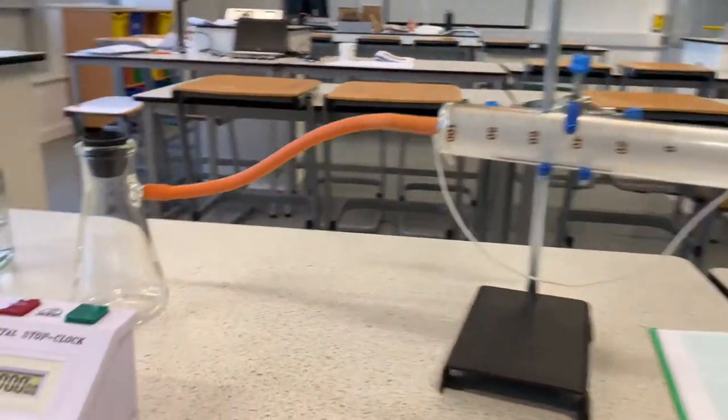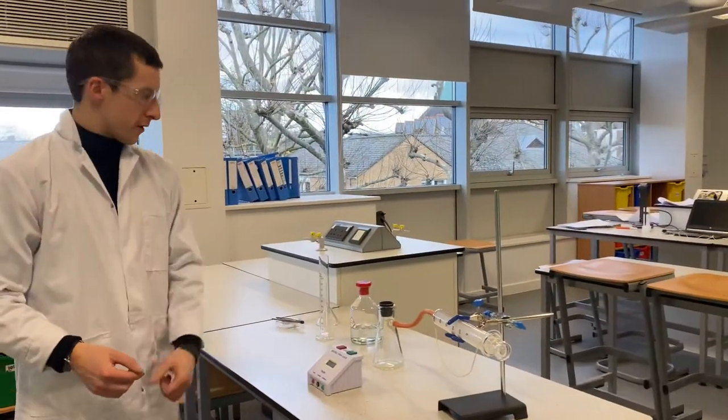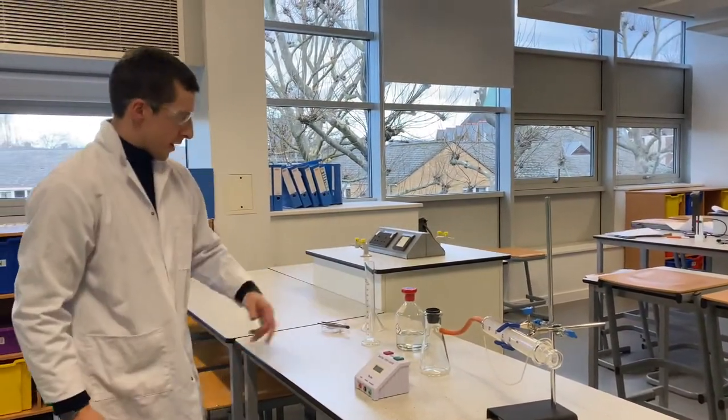Hello Doc, what do we have here? Right, so this is Required Practical 7 Part B. We are going to be measuring the rate of reaction by measuring how much hydrogen gas is produced when hydrochloric acid reacts with magnesium.